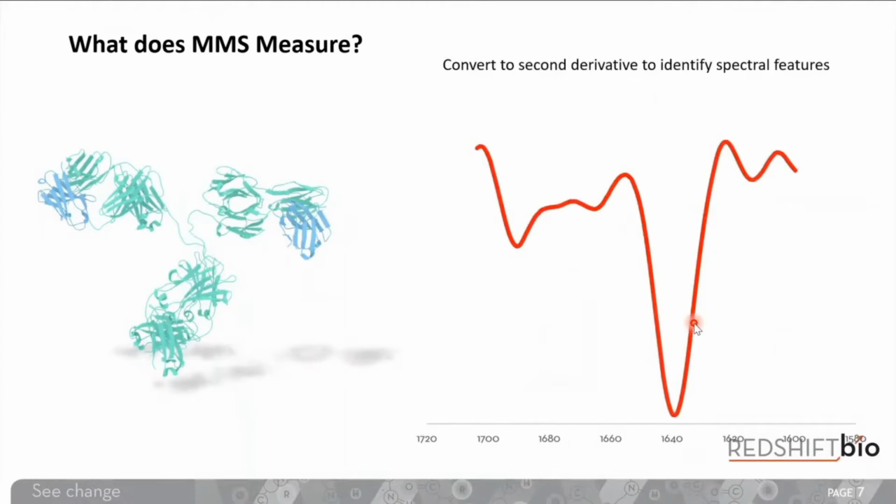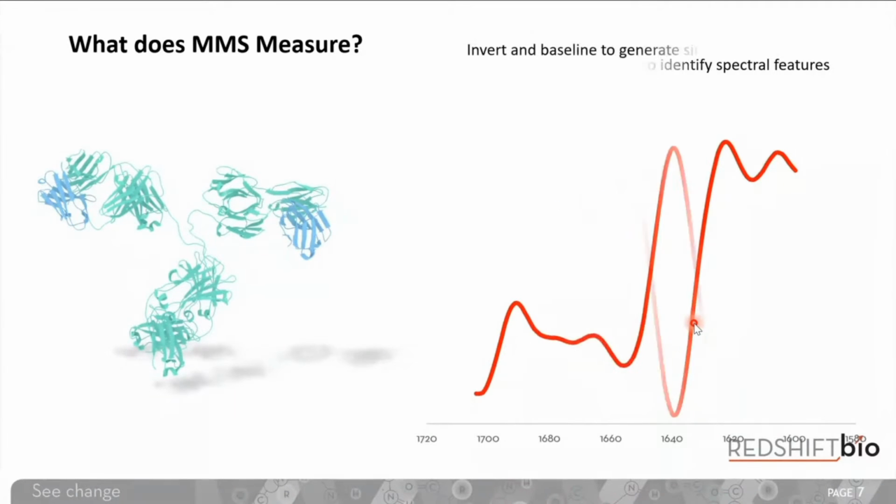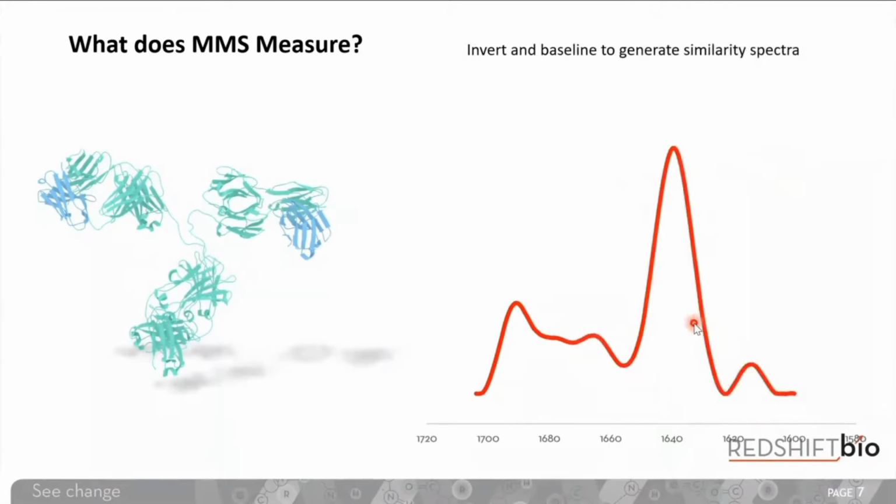We interpolate between the spacing. Little spectroscopy: differential absorbance, interpolation, the software automatically does some math, does the second derivative to highlight the small differences that you might see between sample and reference, inverts it because people like to see things that are upside down, and we background subtract it just to normalize for any concentration differences that may be in there as well, to give us what we call our similarity spectra. The software automatically compares either replicates or between different samples that you are running. For calculating similarity score, we also measure WSD, or weighted spectral difference, as well, if you want to highlight the differences in different regions of the spectra.